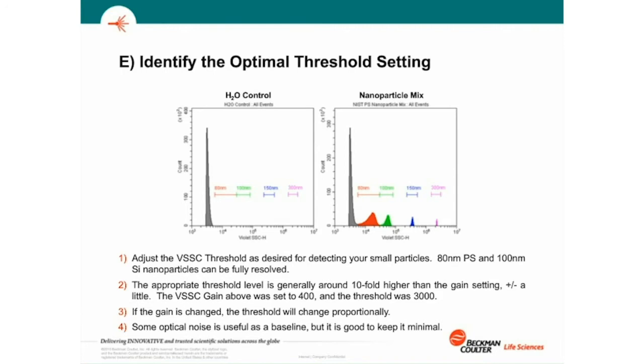Some optical noise is useful as a baseline. However, it's good to keep it minimal. Below your threshold is actually an optical noise range.